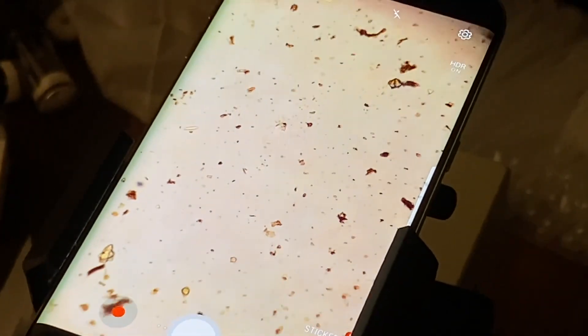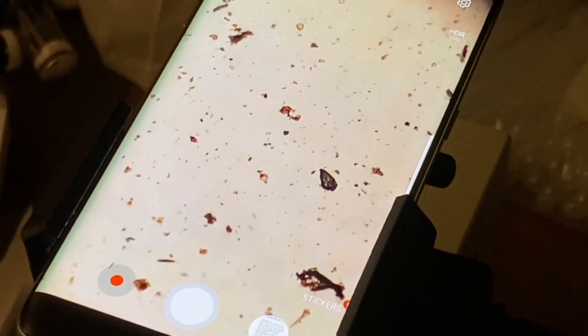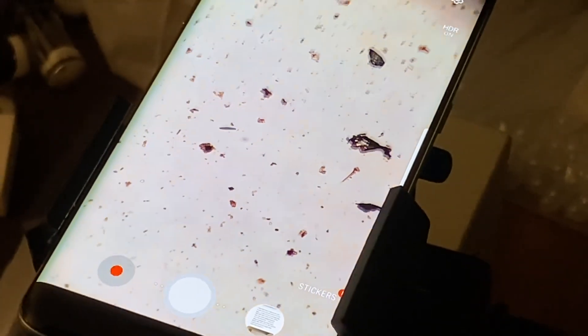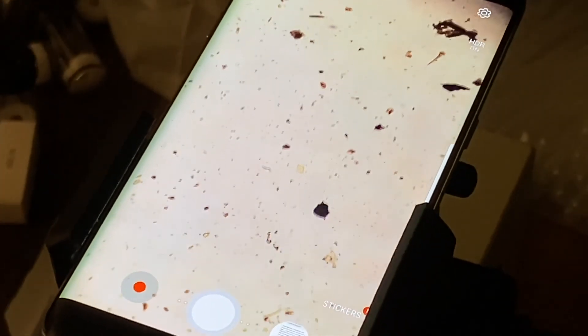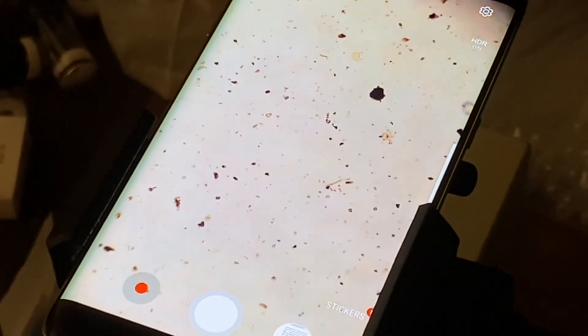What I'm liking that I see is just lots of diversity. We're seeing humic acids, little bits of fungi. The fungi will move in over time because the biochar is present. All these little chunks and bits and jagged things are good minerals. There's some bacteria moving around. Lots of diverse organic matter.